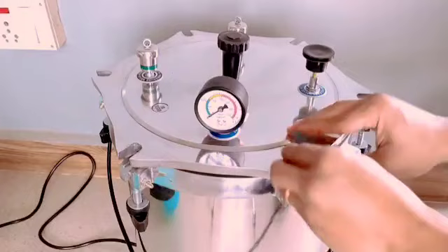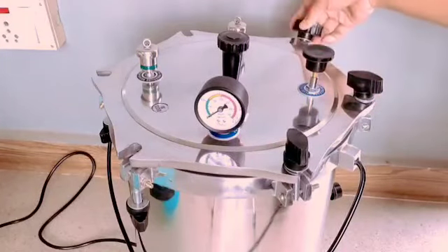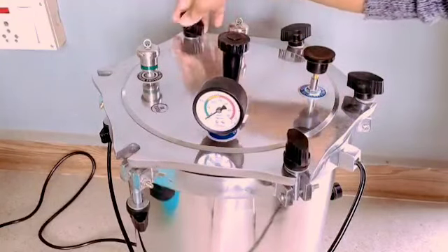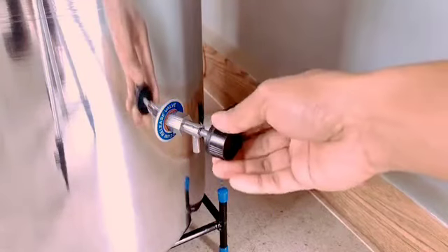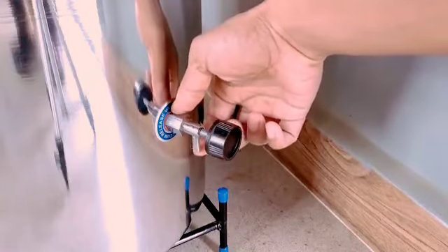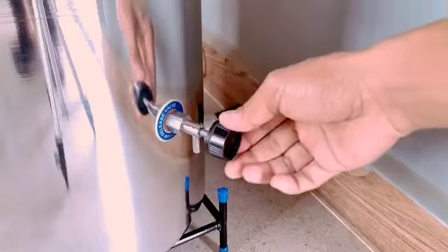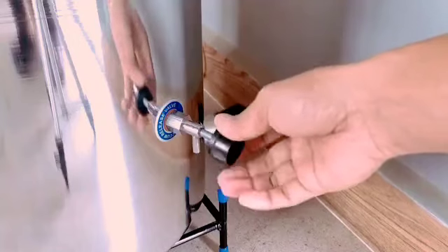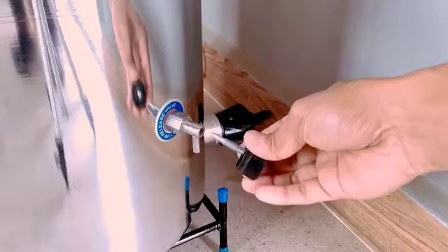Lid screws. About half a dozen or so tight-fitting, sturdy, nut and bolt type screws help secure the autoclave lid when in operation under high pressure. Vacuum release valve. This screw valve located behind the autoclave is opened at the end of the sterilization process to let out residual water and steam from the chamber. This creates a vacuum inside, which in turn extracts any residual steam and water from the contents being sterilized.